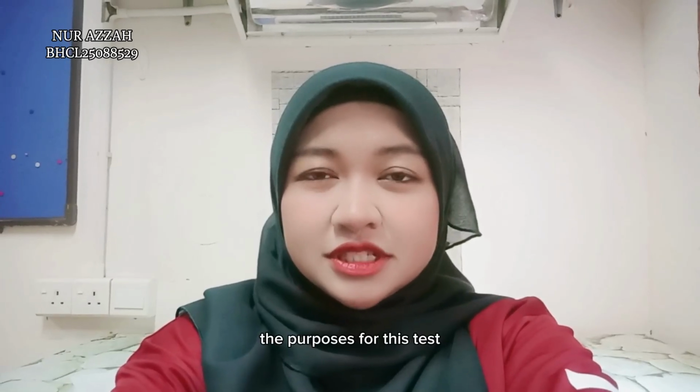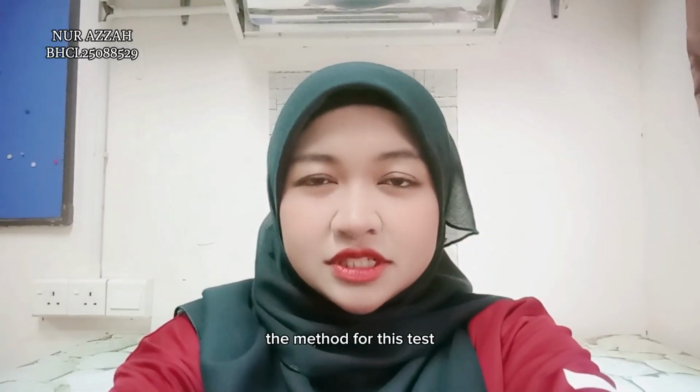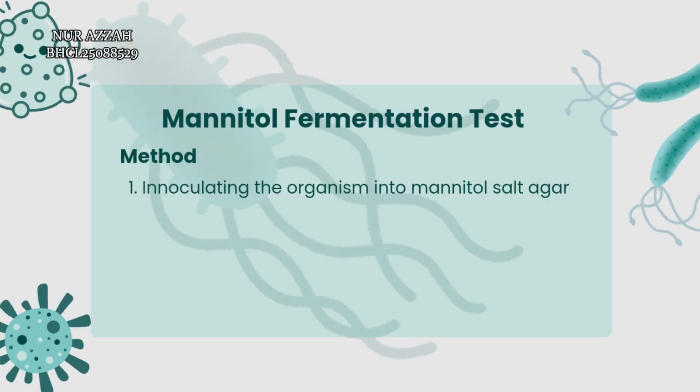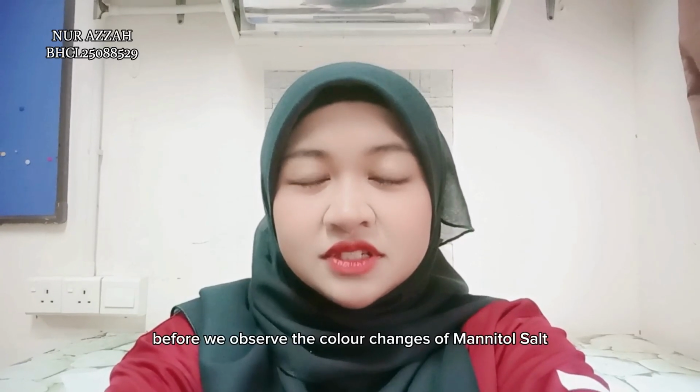The purpose of this test is to determine bacterial growth by encouraging certain bacteria to grow and inhibiting other bacteria. The method for this test is by inoculating the organism into mannitol salt agar, then incubating at 37 degrees Celsius for 24 hours before we observe the color changes of the mannitol salt agar.